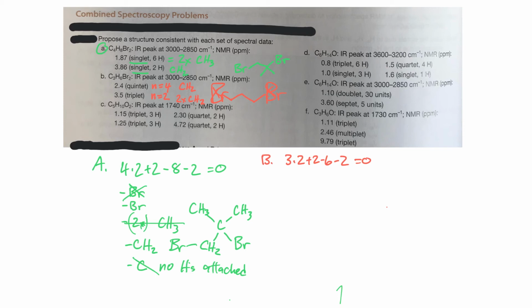All right, let's take a look at C now. And I'll use blue in this case. So C has a more interesting chemical formula, at least in my experience, C5H10O2. I think we'll find that we have 1 HDI here. So let's go with the number of carbons times 2 plus 2 minus the number of hydrogens. And remember that oxygen has no effect on the HDI count. And so in this case, we do get 2 over 2 equals 1. So we have 1 double bond or ring in this case.